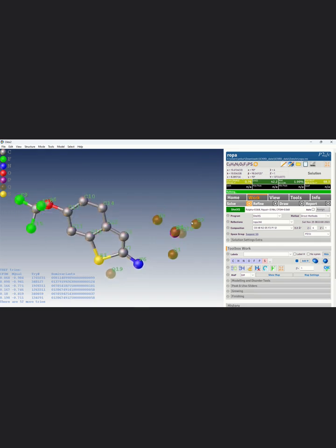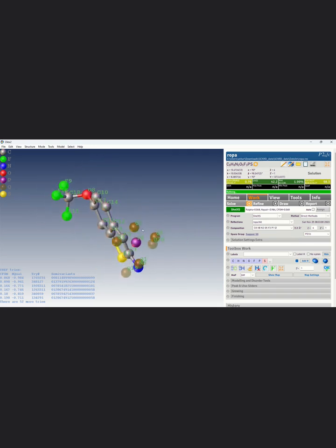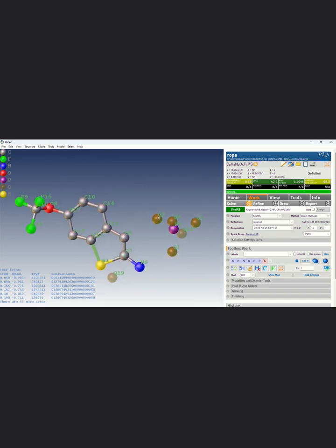So what we'll do is assign some oxygen to them. So I will click. One oxygen we have used there, so 4 are remaining, so I will assign these as oxygen.